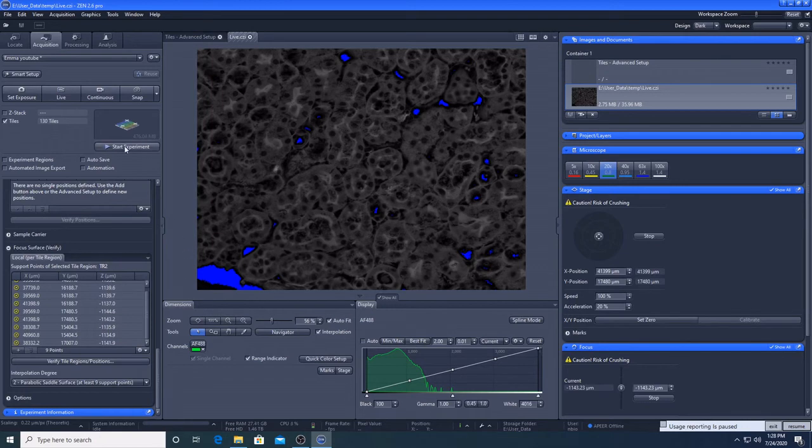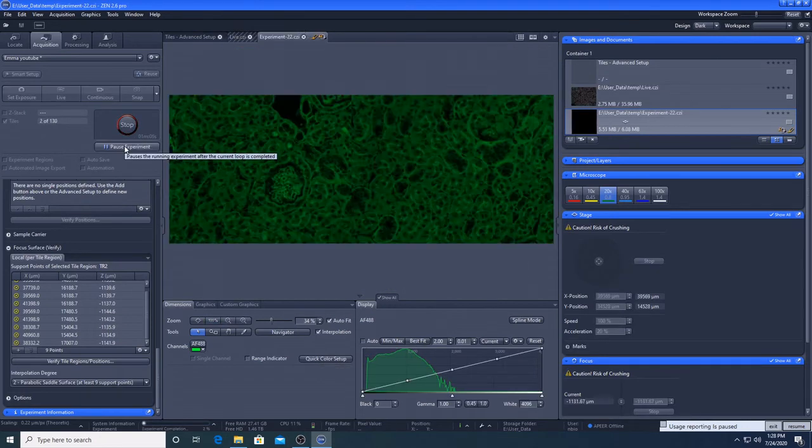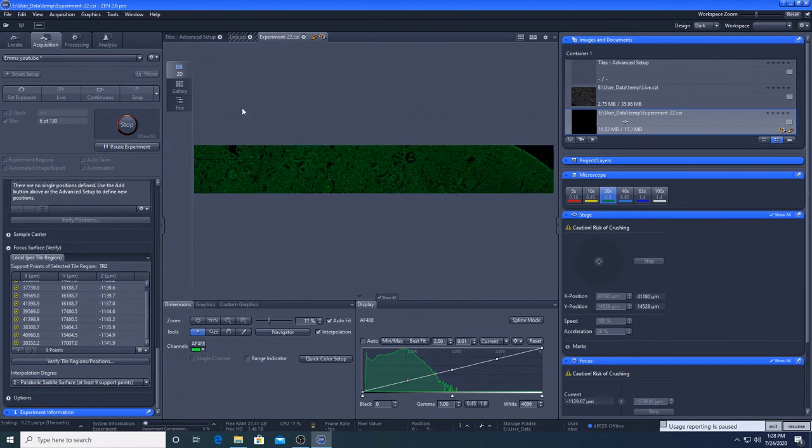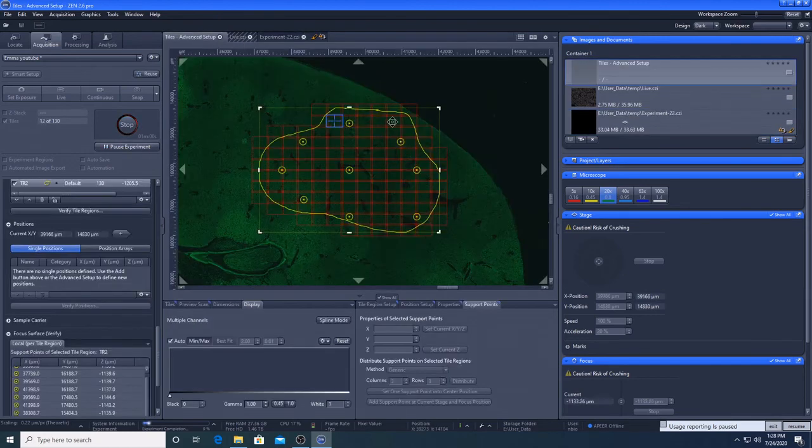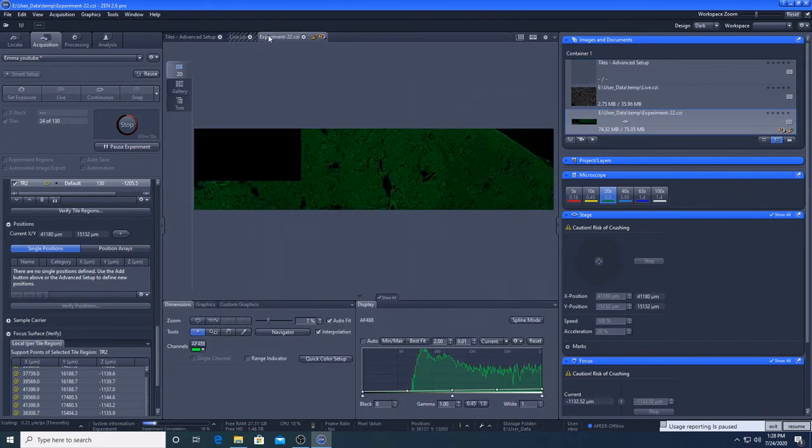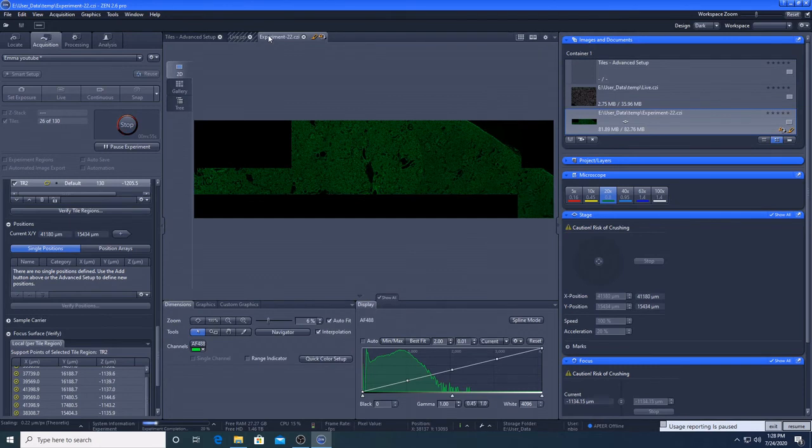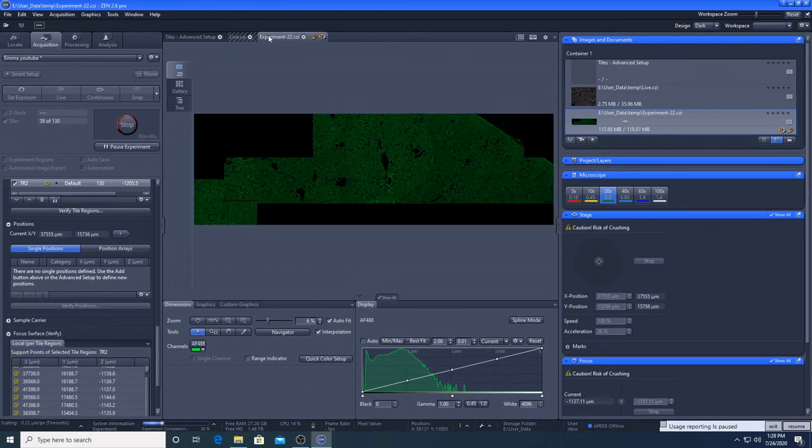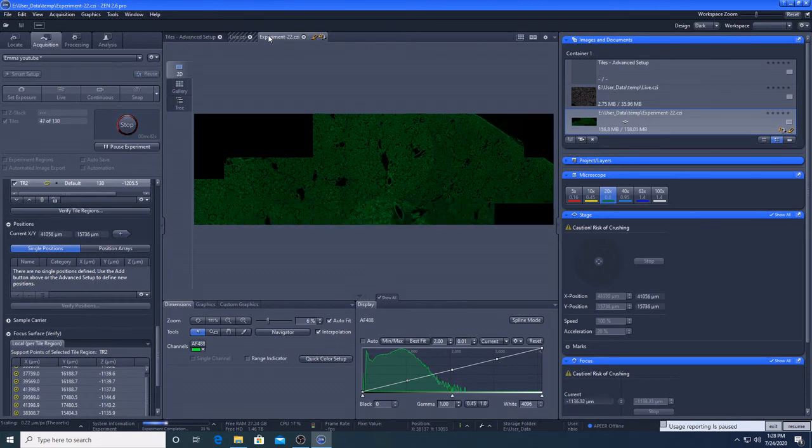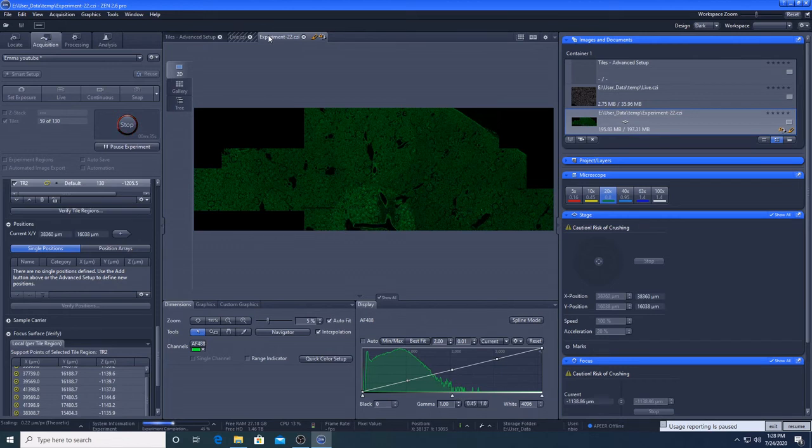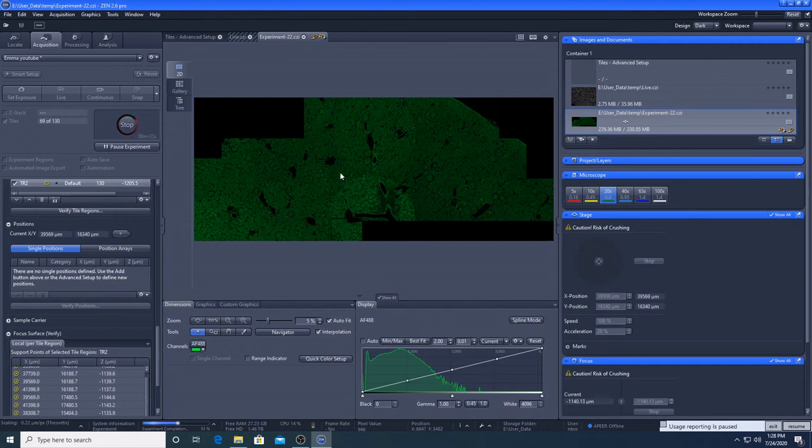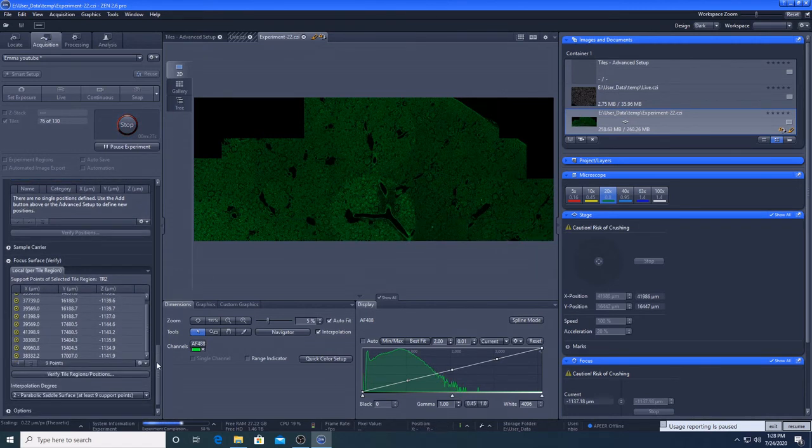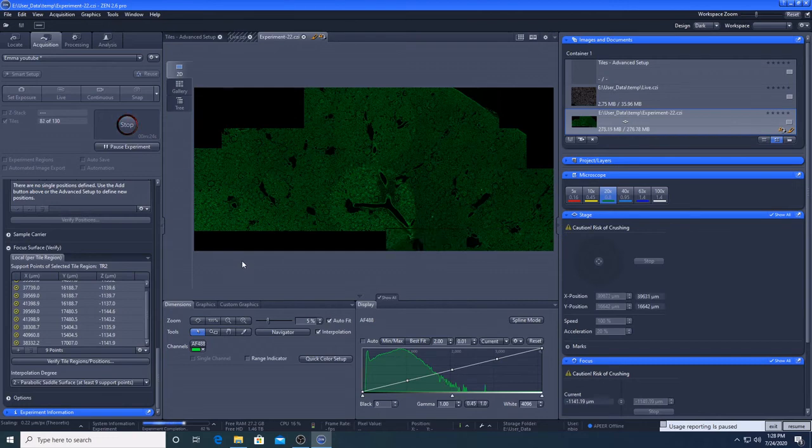And now we're going to go to start the experiment. So these are the images that have been taken. If we go back here, we can see what's moving along. So this is actually pretty swift and that's because our exposure time is so low.